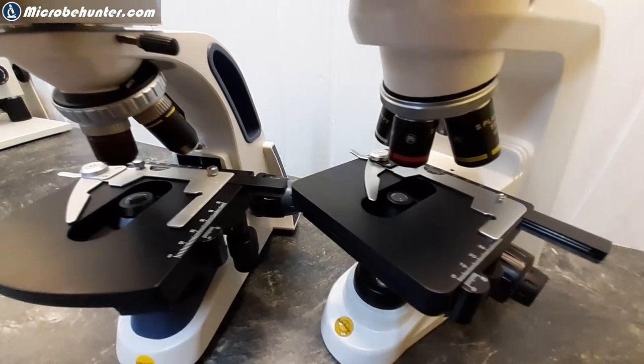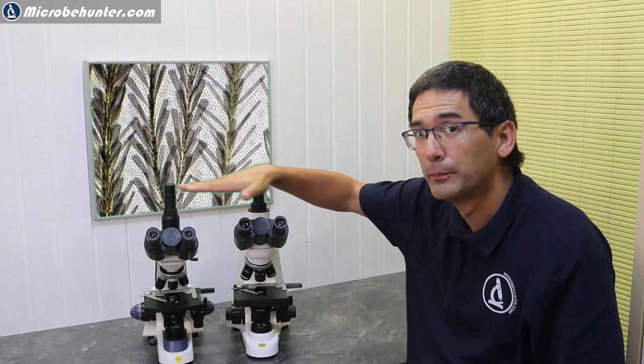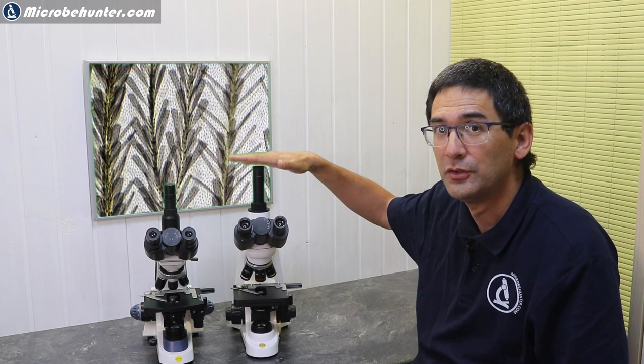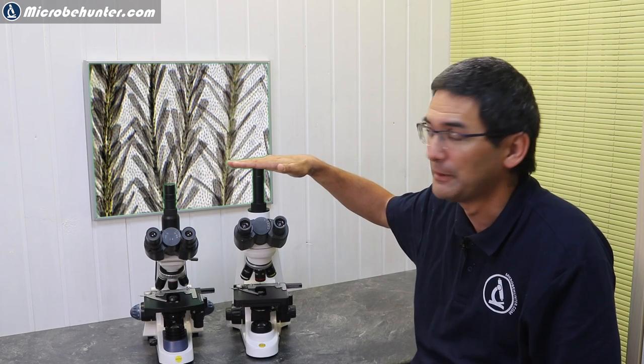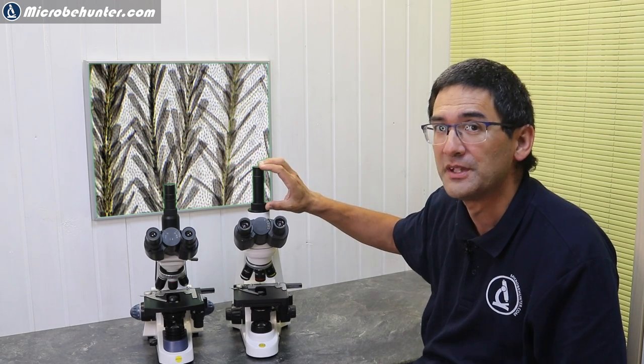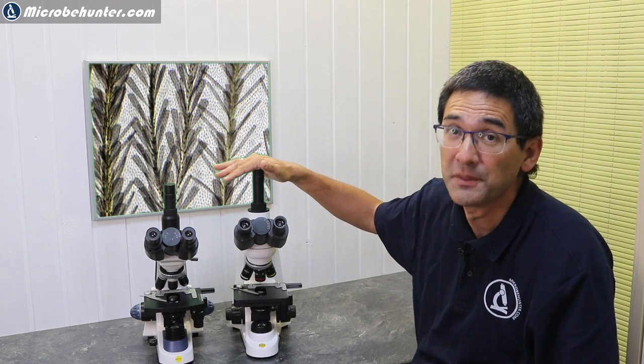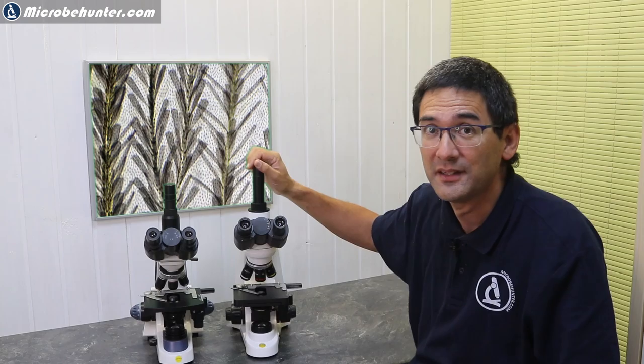The first thing that you notice is that while both of them are pretty much very similar in size, this one here, the Stellar One, is a little bit taller because the photo tube is a little bit taller here.